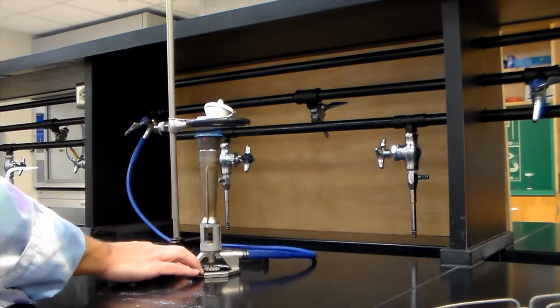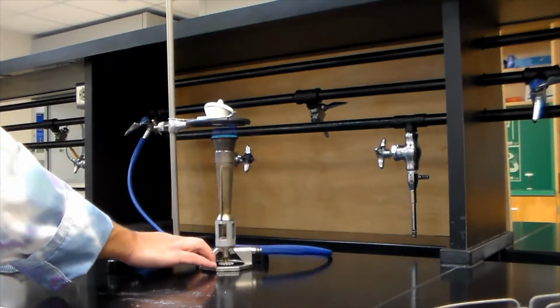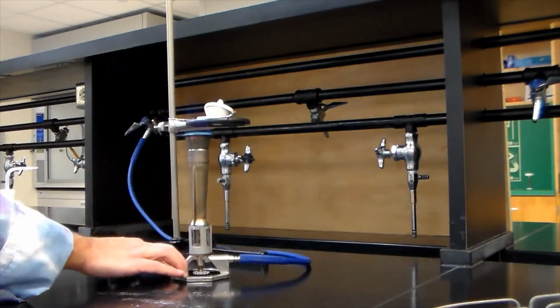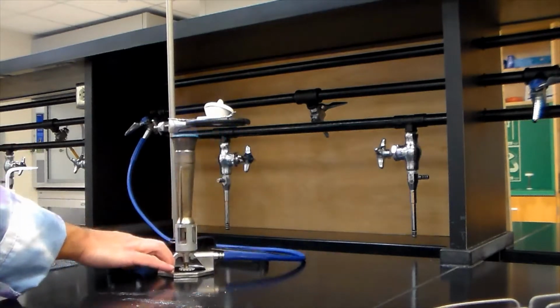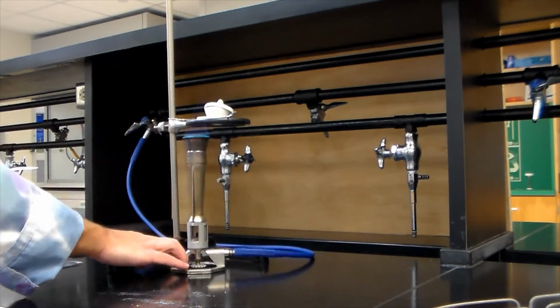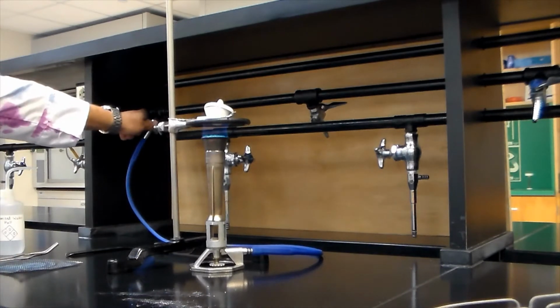If the crucible is heated too rapidly, magnesium vapor will escape in the form of a gray smoke. If this happens, cover the crucible and remove the flame immediately. Do not continue the heating until the vapor stops escaping. This will take about 2 minutes of cooling. After heating, cover the crucible and transfer it using crucible tongs to the wire gauze and allow it to cool for about 2 minutes.